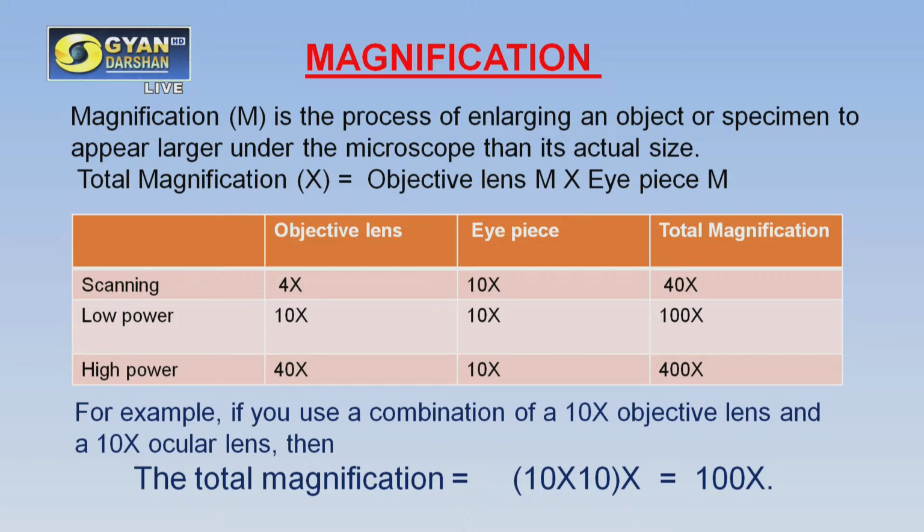You know that in light microscopy three kinds of lenses are used: 4x, 10x and 40x, and the eyepiece is generally 10x. When calculating the magnification of a biological specimen under the light microscope, suppose we use the 40x objective lens and the 10x ocular lens, the total magnification of the microscope is 400x. I am just giving an example.